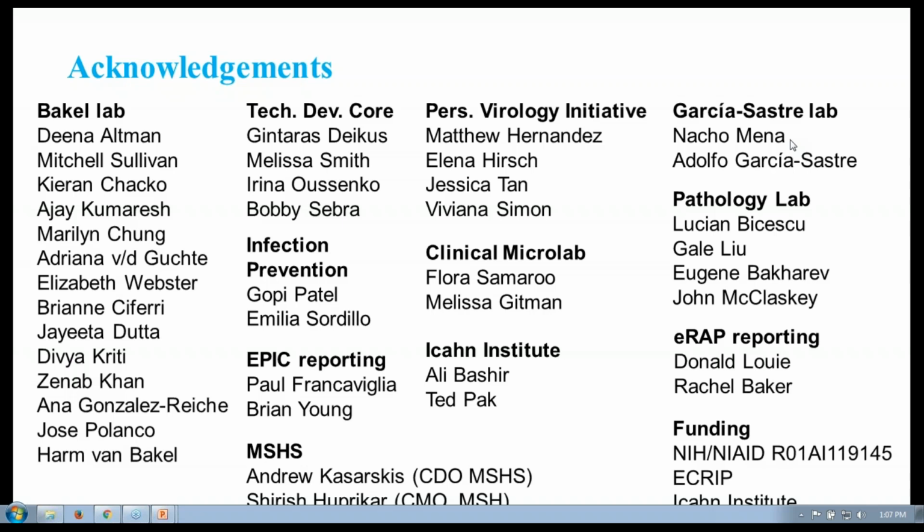And so I think with eukaryotes, it's especially important to get as big a sequence as you possibly can. And even the full-length 18S is probably showing some limitation there as well. So if we can extend that readout even further and maybe use, say, the back end of the 28S, we're also going to be able to get an ITS sequence there, which is a much more quickly evolving region of the genome in between those.